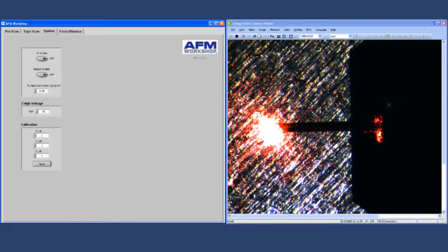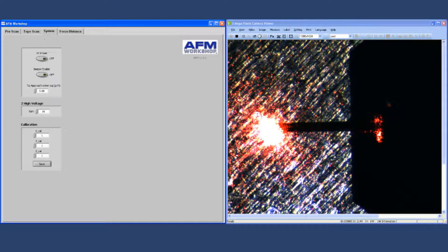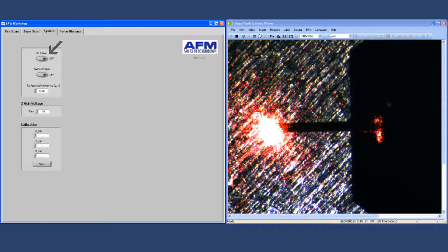The next tab is the system tab, and this is used for selecting different system setup functions. For example, there's a button here for setting the XY gain to zero, which is used for measuring Z noise in the system.